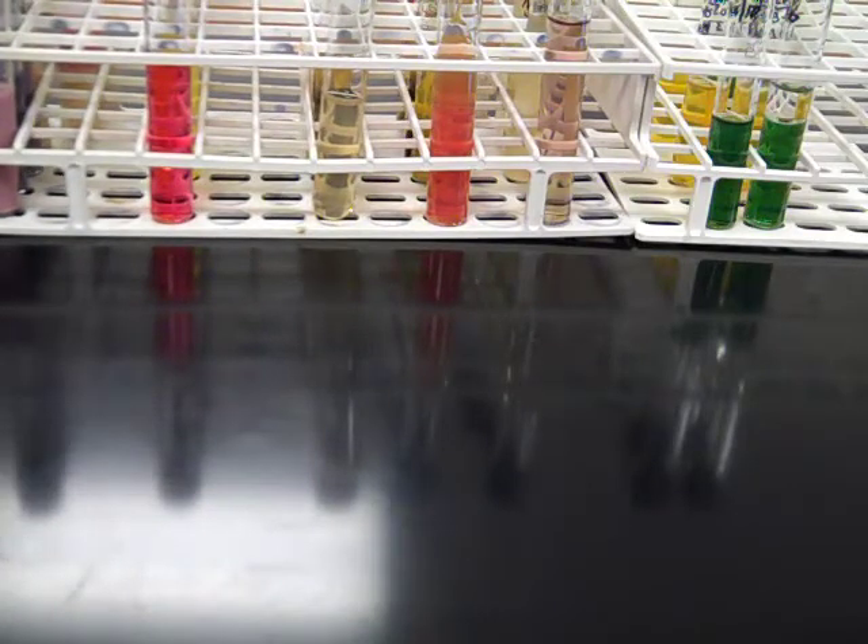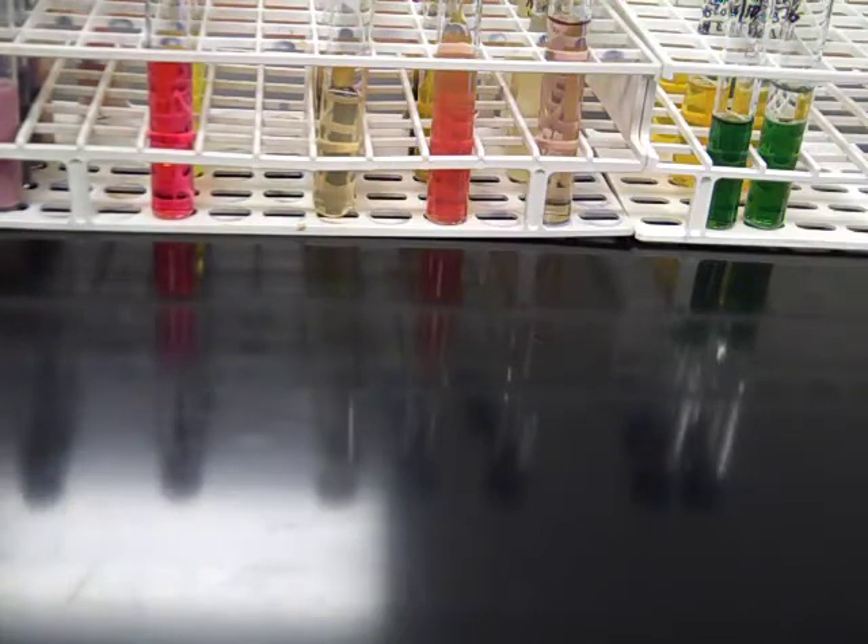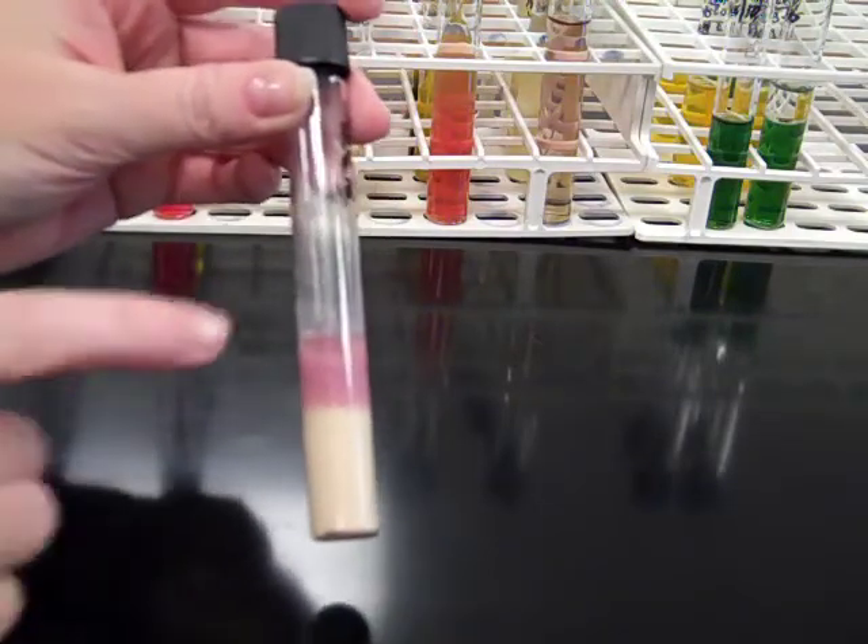The first thing you assess with litmus milk is whether or not your organism was able to ferment lactose. The second aspect of differential litmus milk is to determine whether the organism can digest casein. The first thing you want to look for is casein digestion at the surface of the tube.